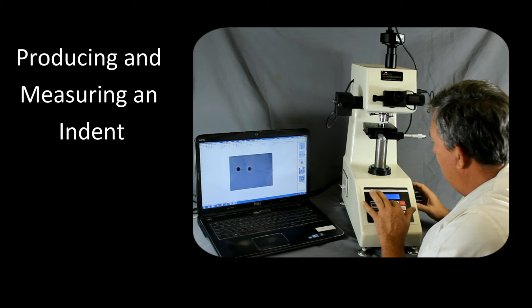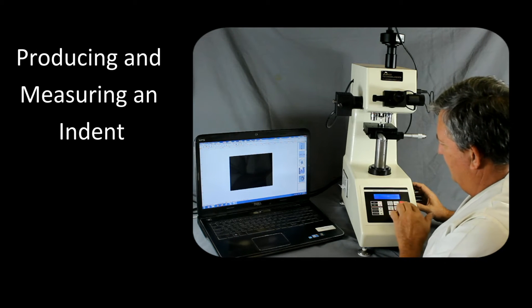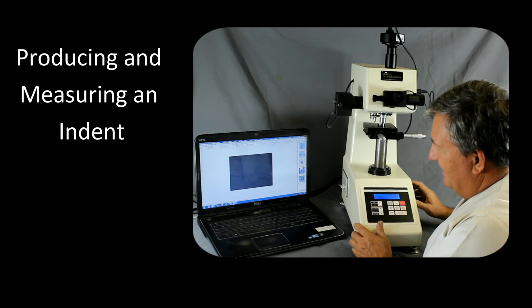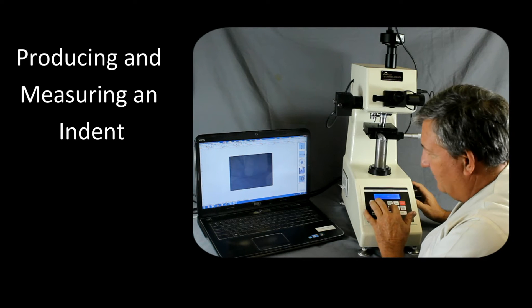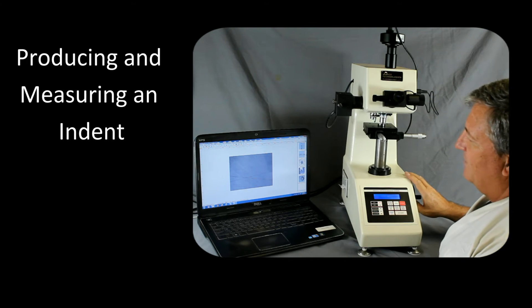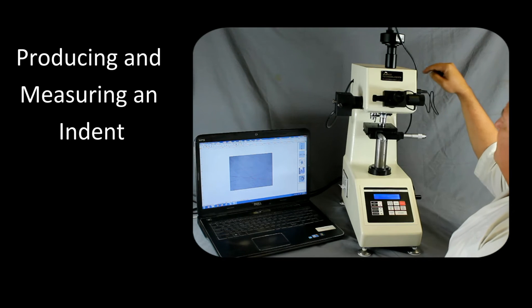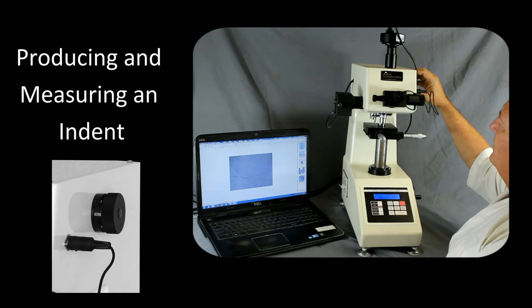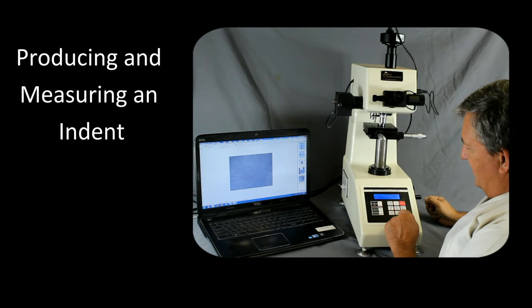Once we're close, let's move back over to the 40x objective by pressing spec and then A to B twice. Then we want to do our focus here, and add a little more light. So once we have the eyepieces in focus, we can adjust our load using this knob. Right now we have a thousand gram load. Once we have that set, all we have to do is hit start.